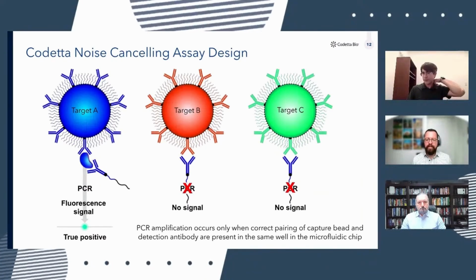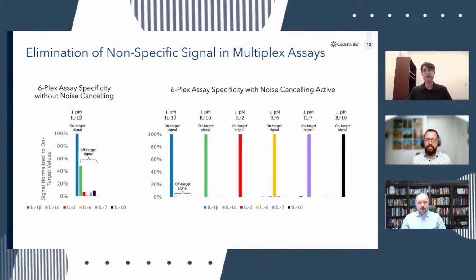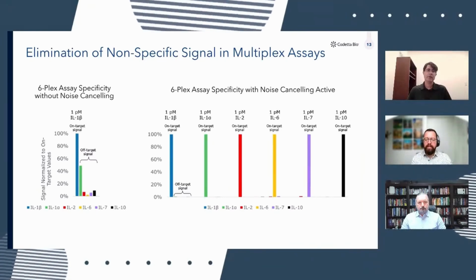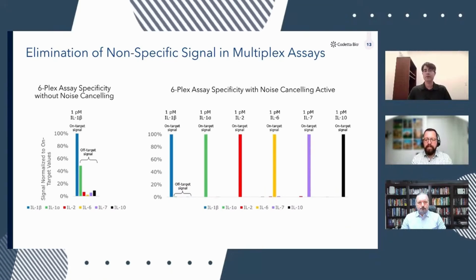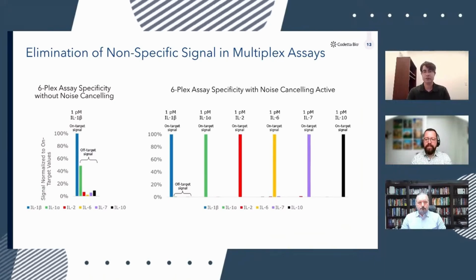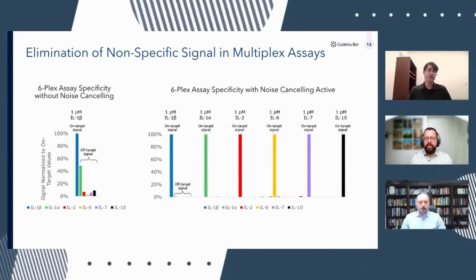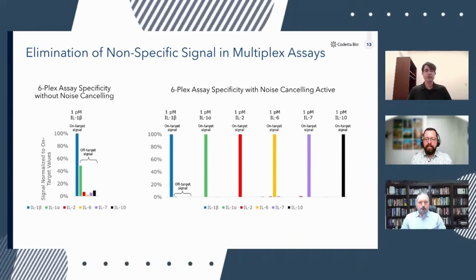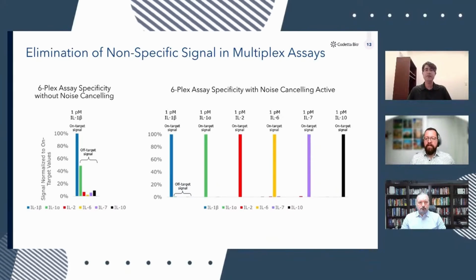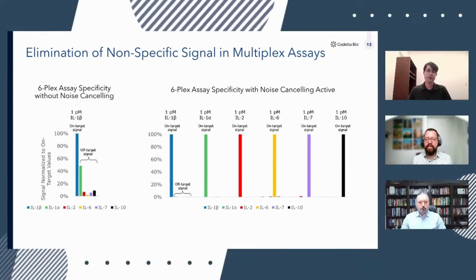And we show that experimentally in the next slide, where we have a 6-plex assay for 6 human cytokines. And the graph on the left shows a case where the noise canceling is not used. So in this case, just standard signal amplification was used to measure the binding of the target molecules on the beads. In this case, we just had a single target added to the sample. So 1 picomolar solution of IL-1 beta was added to a mixture of 6 beads, washed, and then 6 different detection antibodies were added and then amplified.